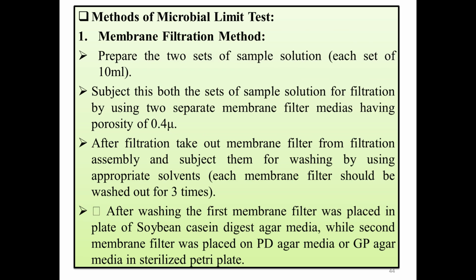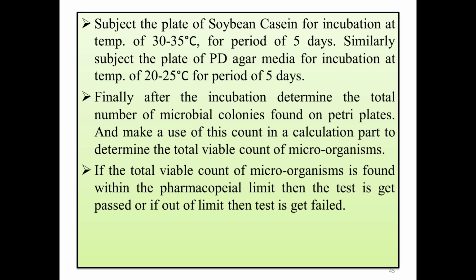We have prepared two parts of the membrane, where the first part is added into the soybean casein media and the second part is added into the PD agar media. So the plate containing soybean casein media is incubated at 30 to 35 degrees Celsius for five days.